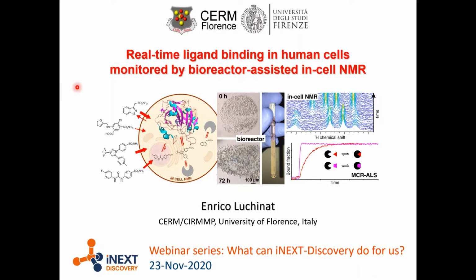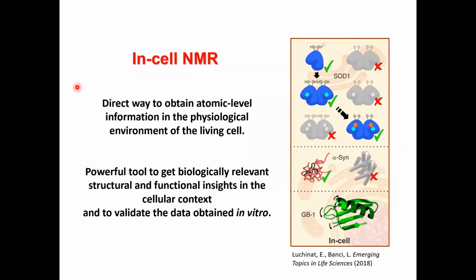I've been working to develop and apply in-cell NMR methods for a few years, and now we are specifically focusing on the real-time aspect of NMR, which is something that, among the atomic resolution techniques, I think NMR is one of the leading methodologies to do. So I'll first show a brief introduction on in-cell NMR, what it is, what we have developed over the past few years, and then I will focus on the real-time NMR part.